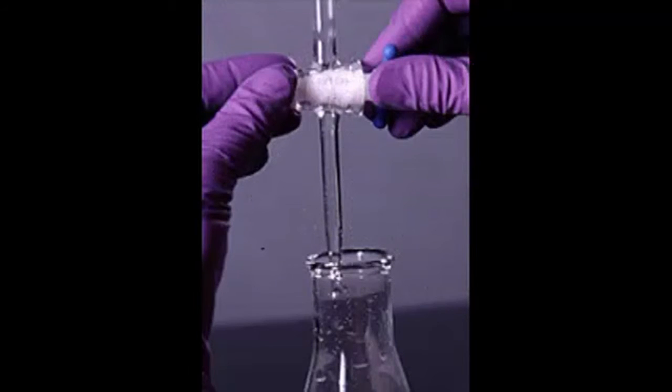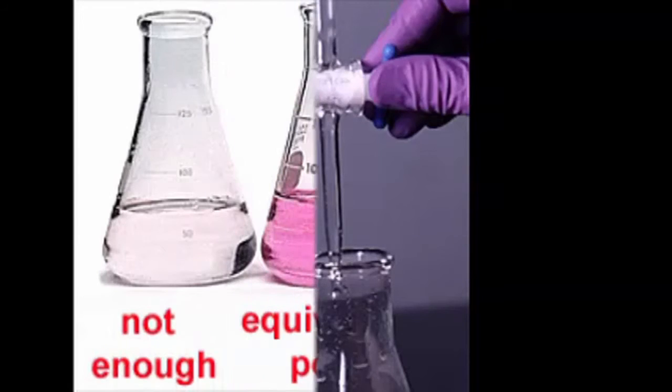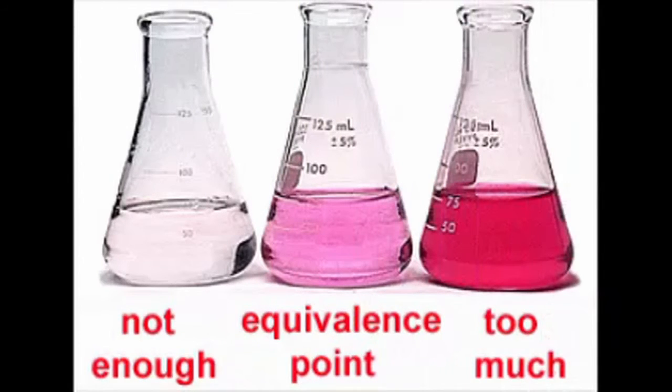In this lab, we resulted with a concentration level of 12.33%. We then realized this concentration level was too high. The reason for this result was the adding of too much base to the solution. Adding an excessive amount led to having a hot pink color, which resulted in a high concentration level.